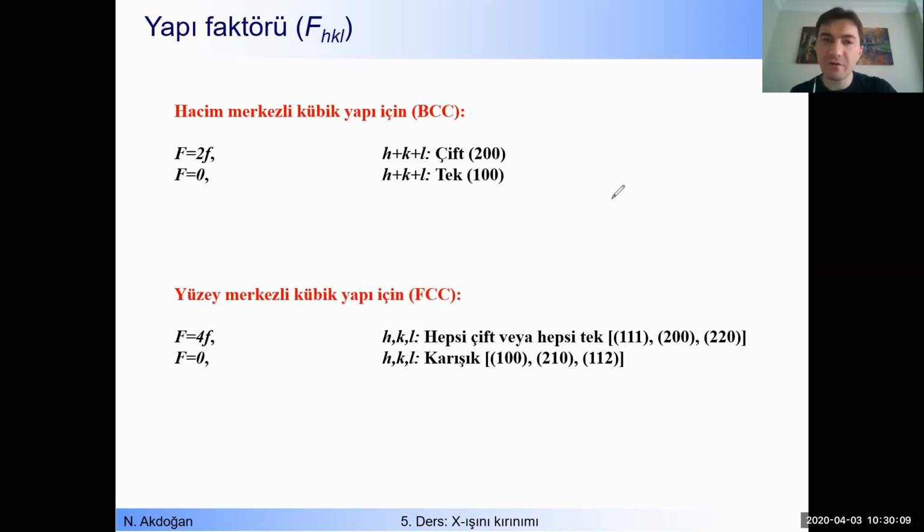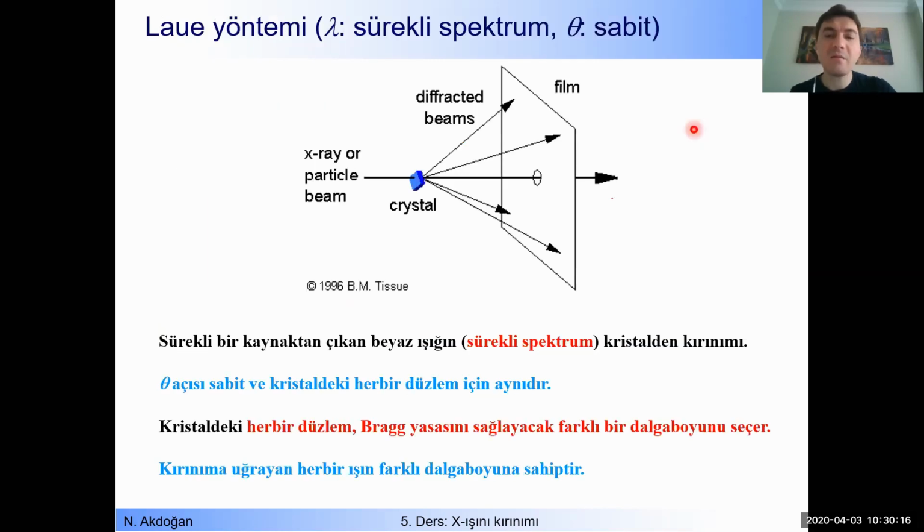So now let me continue. There are many different X-ray diffraction measurement methods. Here I will show you 3 of them, and next week we will see applications of X-ray diffraction. We will investigate a real X-ray diffraction result, and we will try to understand what it tells us.